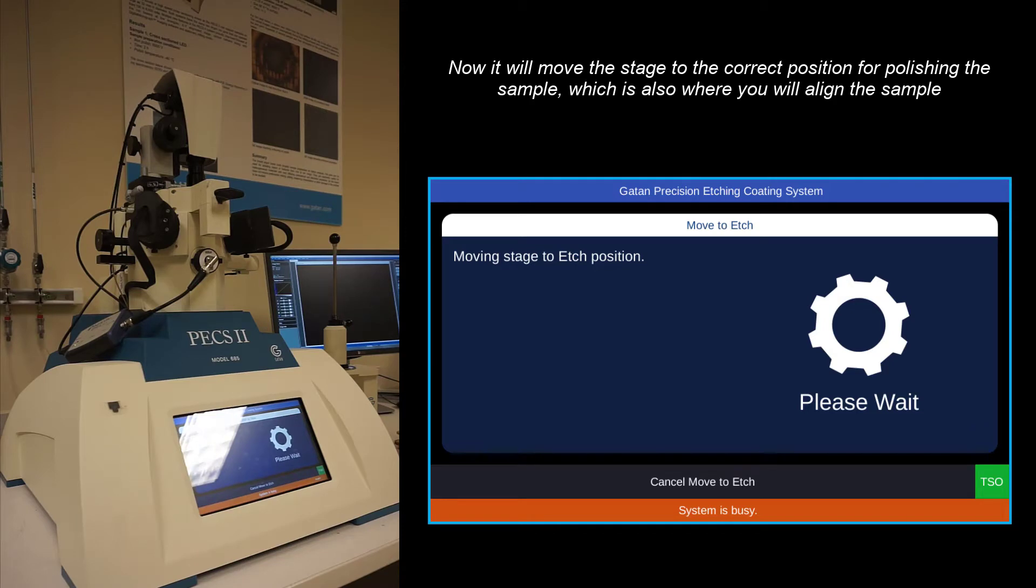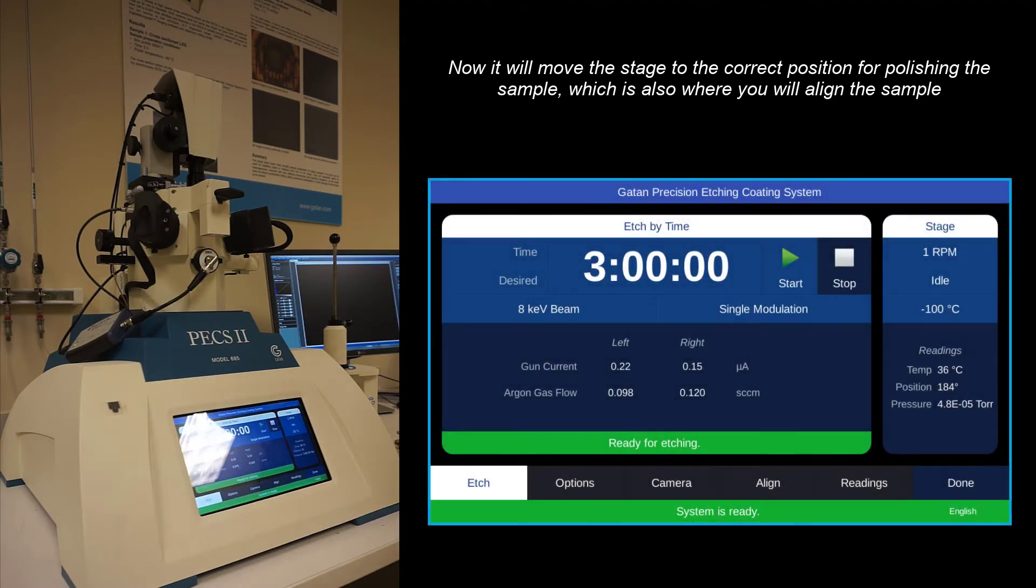And so now it will move the stage to the correct position for polishing the sample, which is also where you will align the sample.